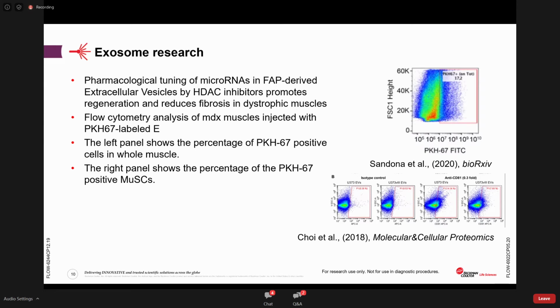Its stated limit of detection right now is 80 nanometers, and the ability to detect and quantify exosomes directly via flow cytometry became possible in the last 3-4 years. So I hope it will open the door to further investigation of exosomes for both pure research and for applied purposes.